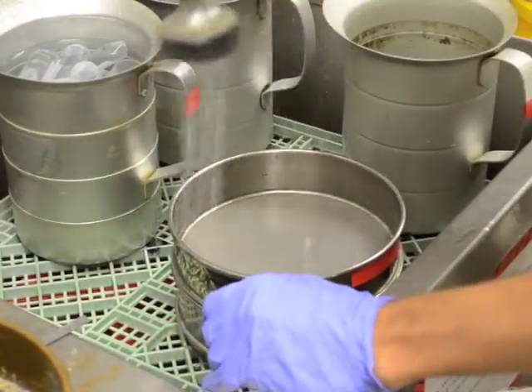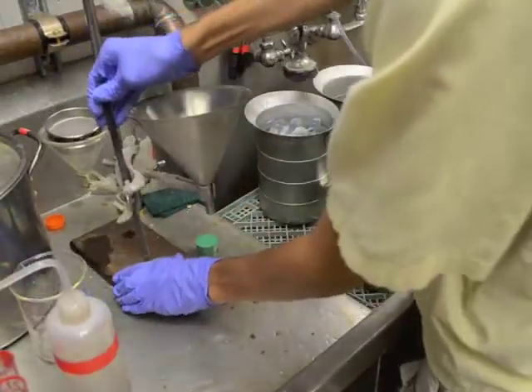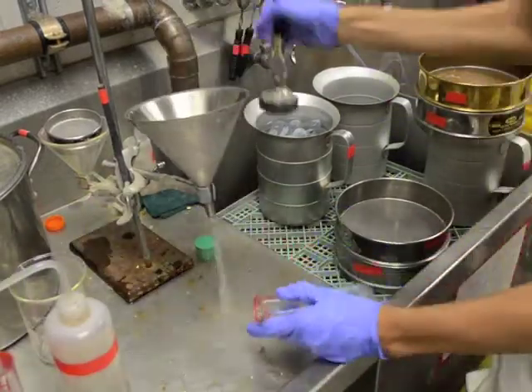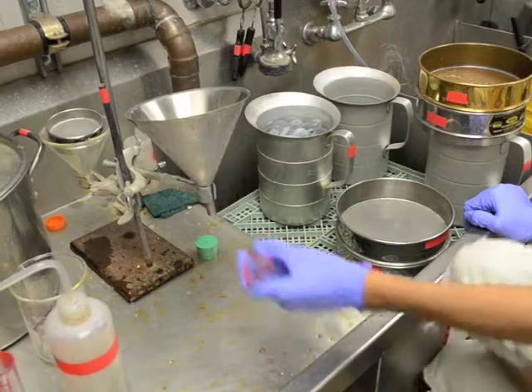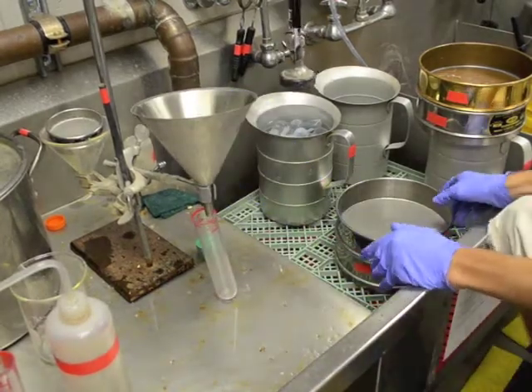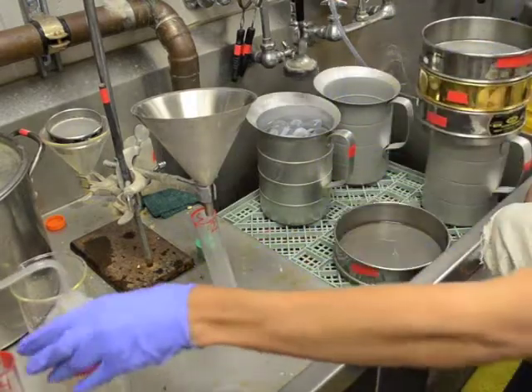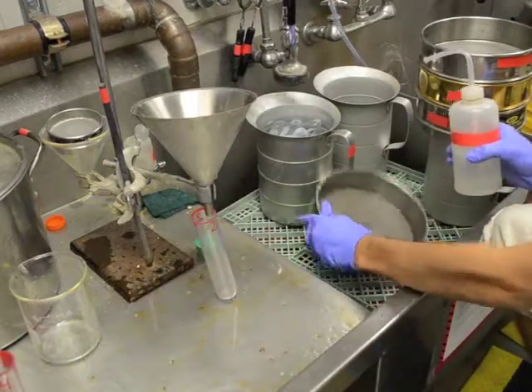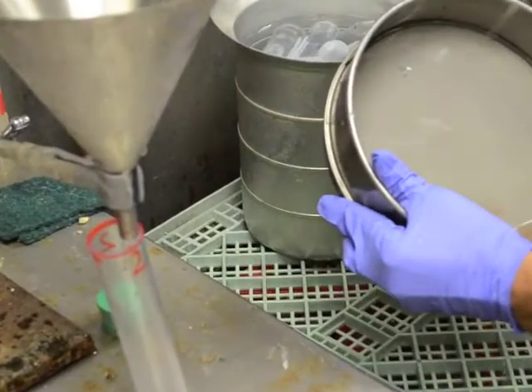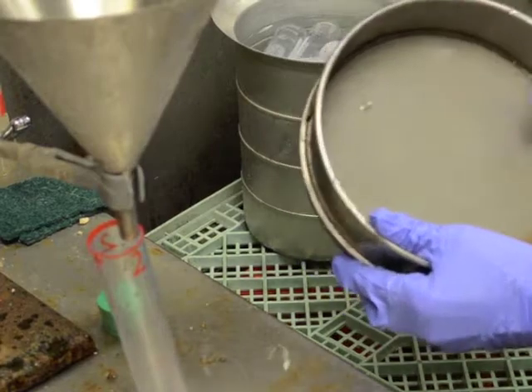Rinse the 325 mesh sieve and remove it. Transfer the contents of the 500 mesh sieve into a weighting 100 milliliter centrifuge tube.